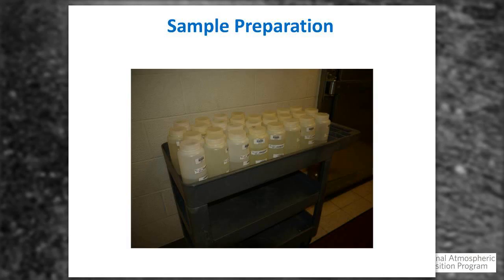Sample preparation is, as they're unpacked out of the boxes and removed from the bottle, they're given the barcode that will identify it with the sample number, the barcode that also is put on at the time of receipt. And then this particular cart that has been filled from a day of activity and shipments will be moved on to our lab. Coming up next, if we don't have any questions, we'll talk about how the sample proceeds through the lab. Are there any questions?